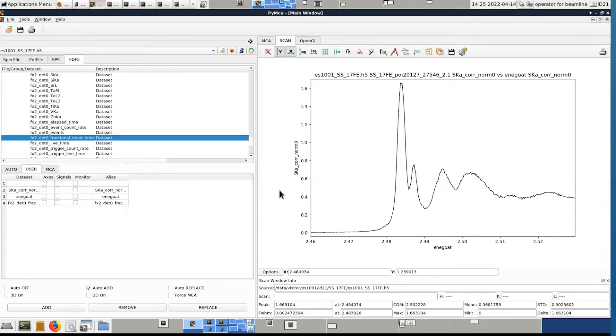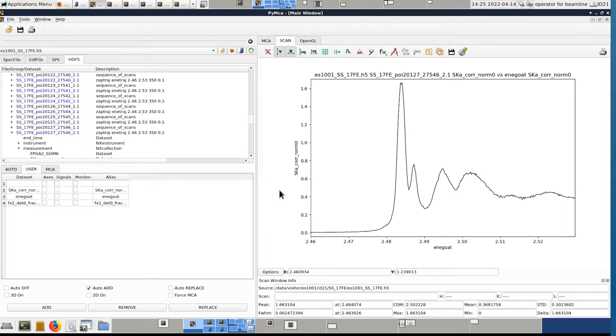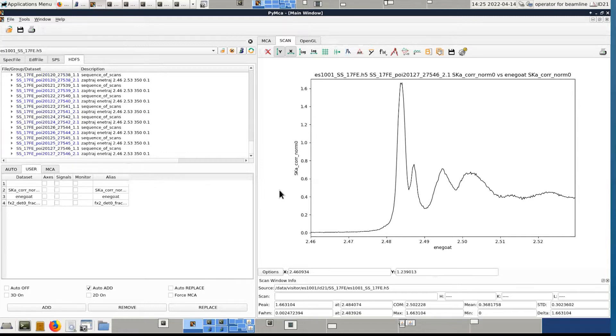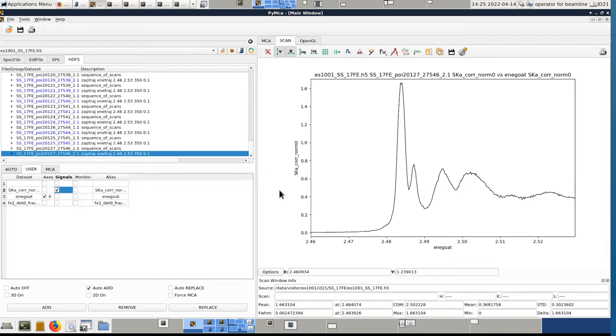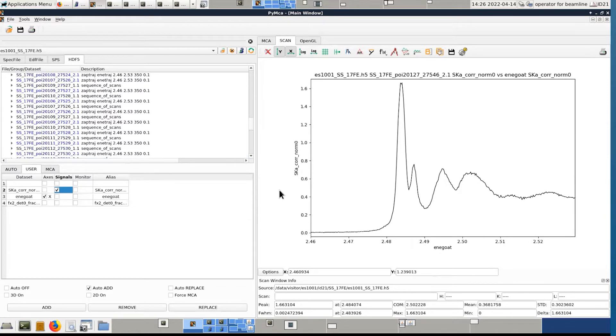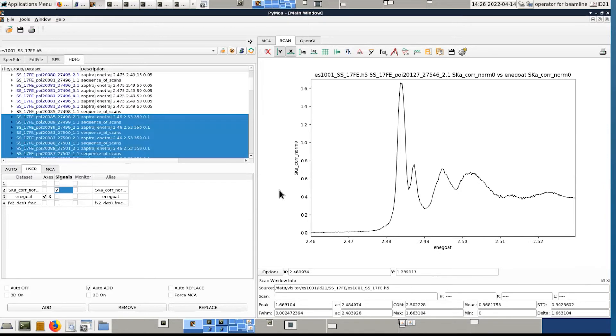So now that I have these three counters, I can close this, reduce it, and then enegote, sulfur, and then replace. With this, I can easily superimpose the 45 XANES, replace.